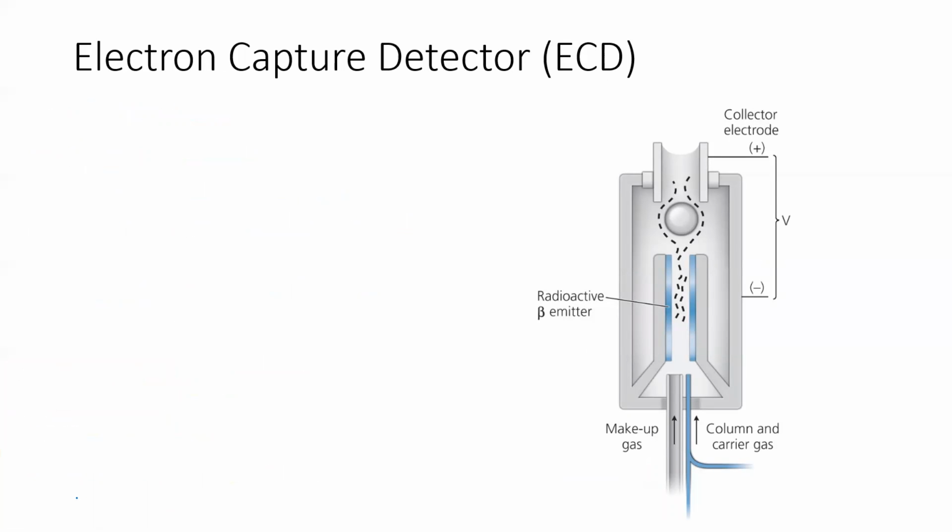All right, electron capture. This one is an interesting device because we have some radioactive foil, right? And so this radioactive foil, it's nickel. I think it's nickel-63. It's some isotope of nickel, often, or it could be tritium, right? It could be just coated with a layer of tritium.